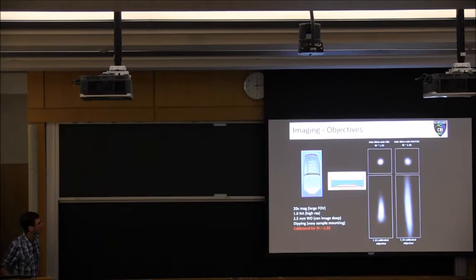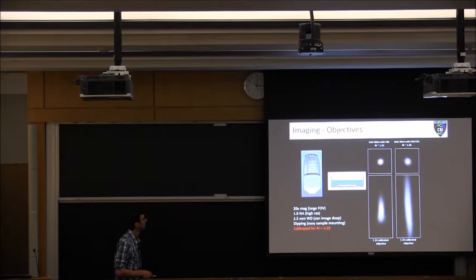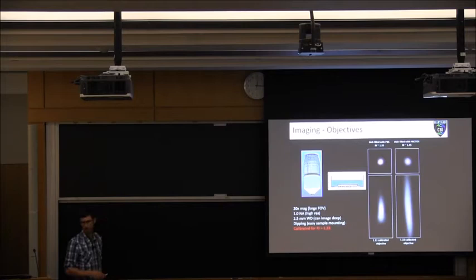Now, if we do that exact same experiment, again with this objective, but instead of water or PBS, we put in Protos solution, you can now see that this is looking a little distorted. It's really bright in the middle, but then getting dimmer on the outside. These images are averages of the 3D stacks on top of each other. But the big problem you see is in the Z dimension, you get this really large stretching of the point spread function. Things are really ugly when you actually start to do some 3D imaging.